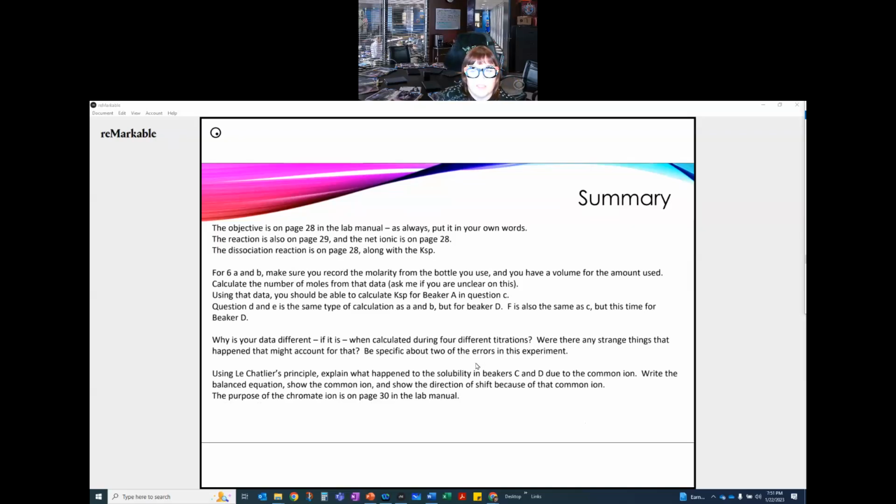Again, this is meant for you after you've started looking at the laboratory, and we've talked about the lab in its own video. This is information that's being presented to you so that you know where some of these answers are in the lab manual. Again, I will be providing you data from what is actually done in our physical laboratory. So you'll be able to look for 6A and B, make sure that you record the molarity of the bottles that were used.